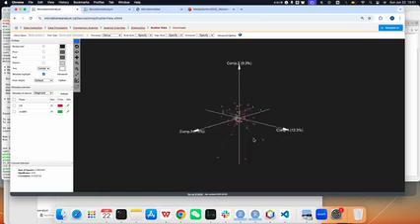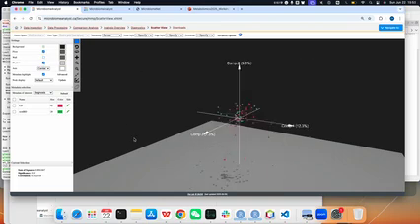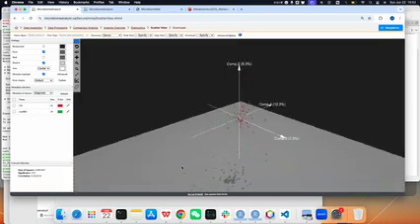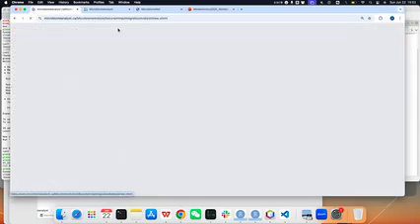I don't have time to show all the visualization options. You can explore them. We can add the background, the floor or the wall, or you can see the shadows here, because these are all visualization techniques. You can also change the node style or the edge style, and maybe the taxonomy, and download here. So you can explore more using our example data, and then I will go to DIABLO.